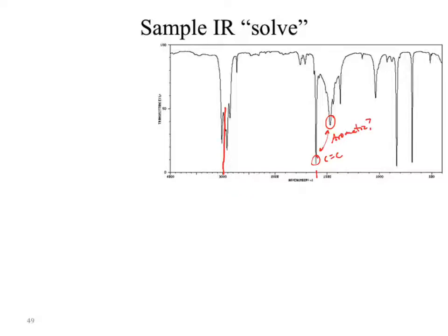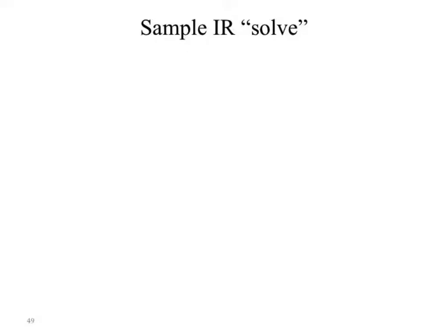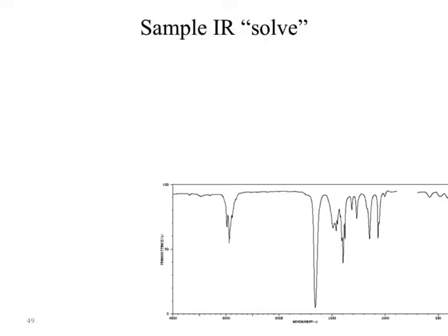Notice again, I put a question mark there. I don't want to put overweight on that. I'm now dancing with the fingerprint region. So does the aromatic ring have to have that second peak behind it? It doesn't have to. Another 5 seconds. I lied, I don't want to wait. What do we see?